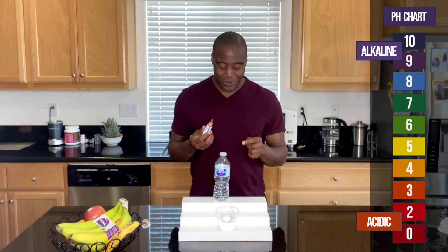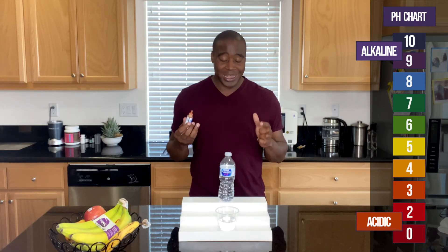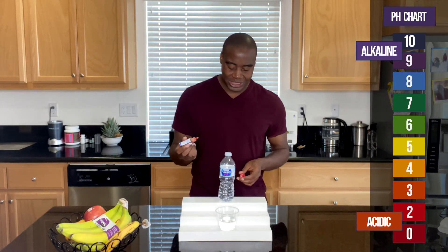If you want to see the full breakdown we do with Nestle Pure Life Water, be sure to check out my other video where I go in deep on everything this water has, what it does, and how good it is for us. All right, without further ado, let's see what we get.